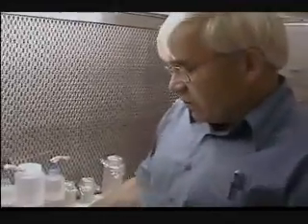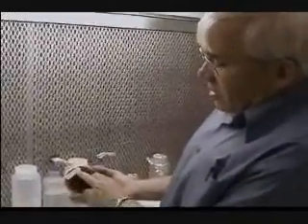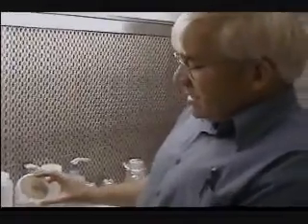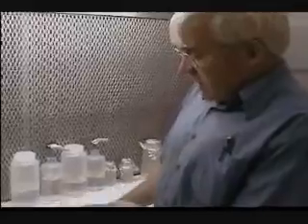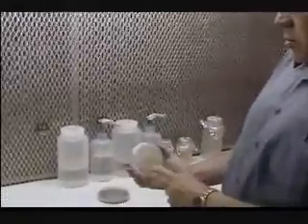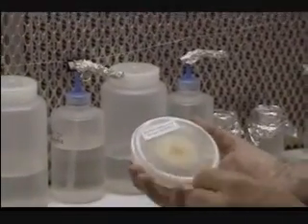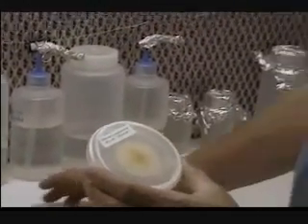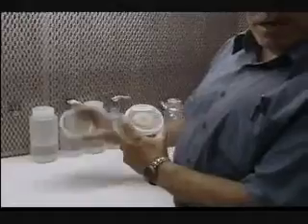Once we have a number of these starter cultures — these are just two different colors. This particular one is a little darker brown; this is Pisolithus tinctorius, from Chile. We send it down to Chile for a number of species, mainly radiata pine, which is very similar to red pine, and eucalyptus uses that species. And then this one is Hebeloma cylindrosporum, and that's for pine and spruce for all species here. That one's just a little further behind — they both started roughly the same date, but the South American Chilean species grows faster, more aggressive. So it filled the plate, whereas this one's about half full.